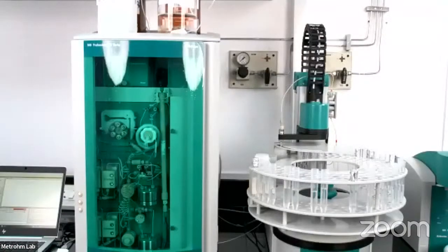One more thing I want to say here: this is entirely software operated, and the software is installed in the computer. So you get to completely control the instrument through this, and with one software we can even control four instruments. That is also possible, or four detectors can also be monitored. So this is about the ion chromatography session. Now I will shift to voltammetry.